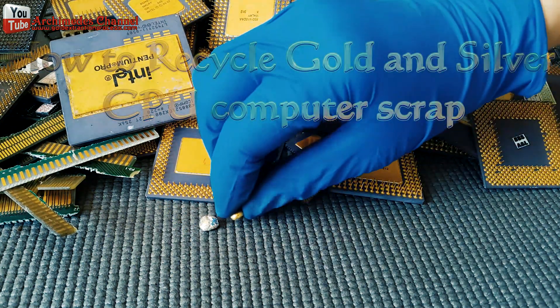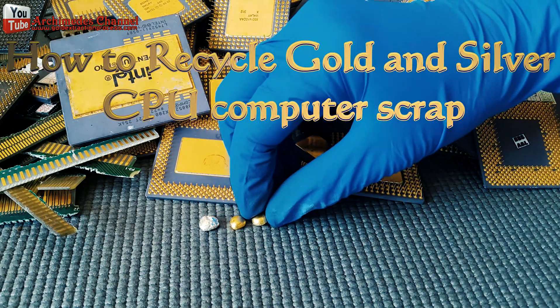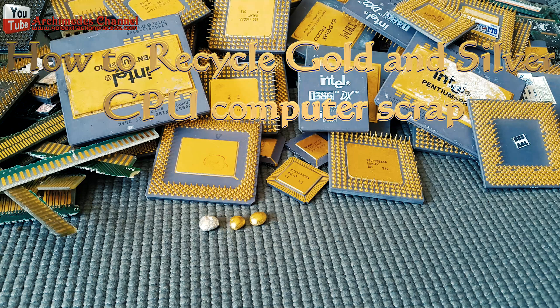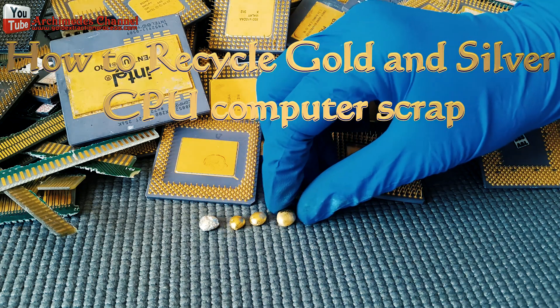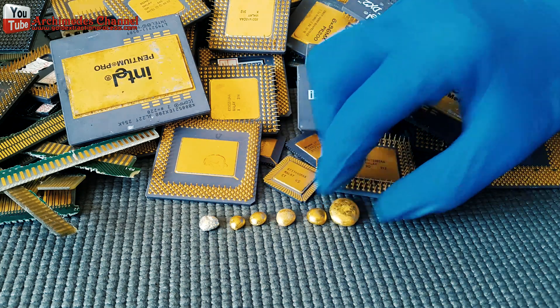Hello friends, today I will recite silver from the old CPU computer. Chemical is very dangerous. You should strictly protect in every step. You have to wear gloves, mask or protective clothing when you work.